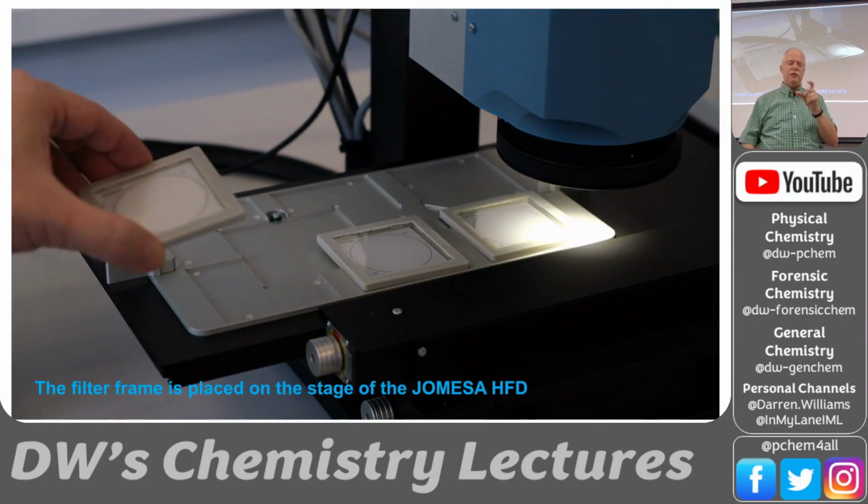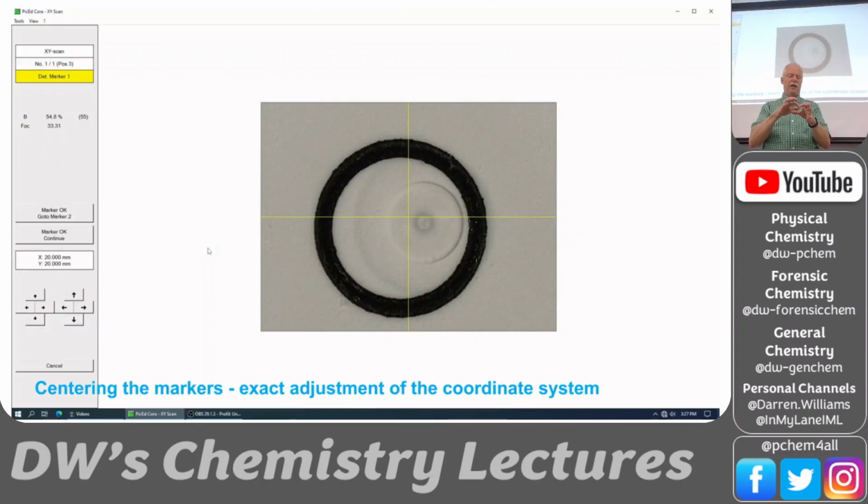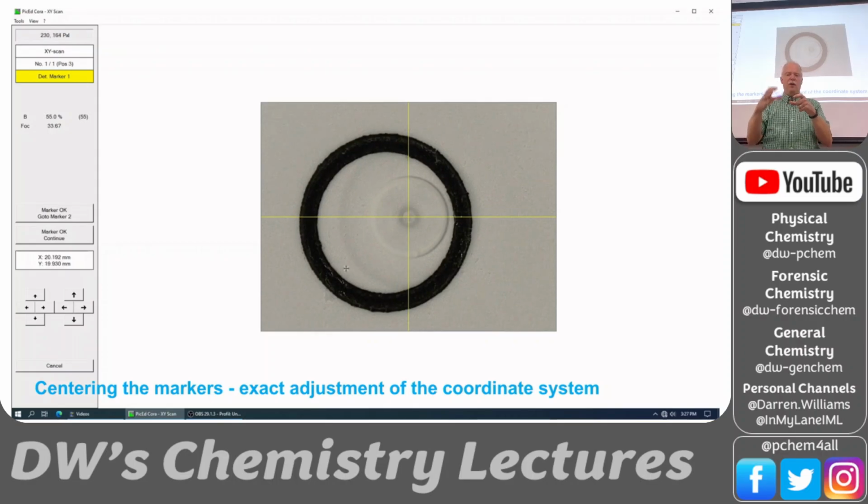So this is the little filter disc that you take out of this washing station, and your particles are dispersed on the filter disc. You tell the computer where the disc is located.